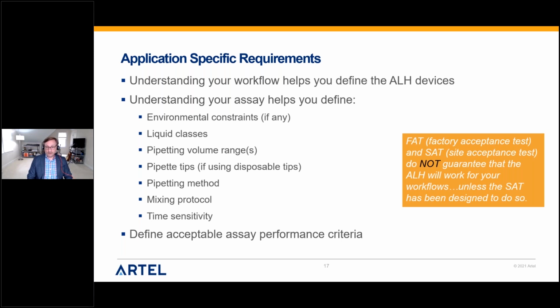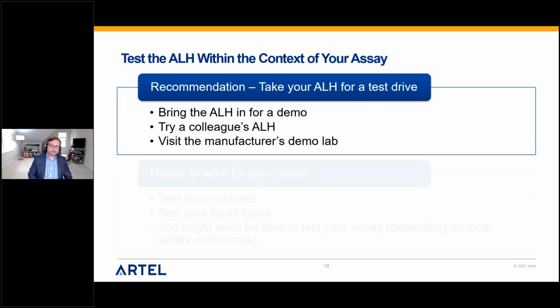But like I said, a lot of these site acceptance tests, they have nothing to do with your assay necessarily. It's about performing in the field once it's set up. And again, these are typically associated with setup and get that stuff installed properly. So just keep that in mind. Just because there's a FAT or an SAT, that doesn't guarantee that it's going to work for your assay.